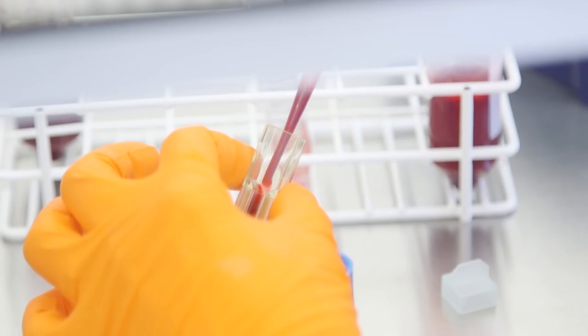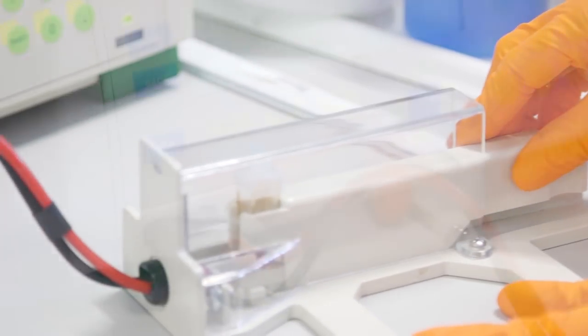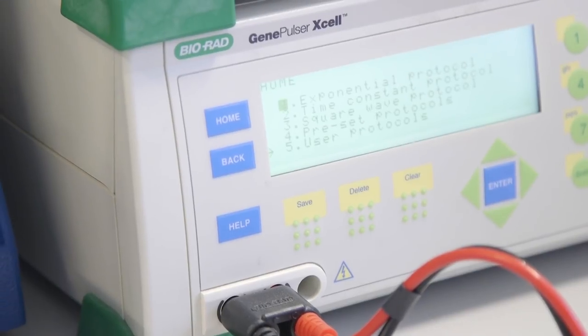We genetically modify the parasite to knock out or modify certain genes in order to assess whether these are involved in the disease.